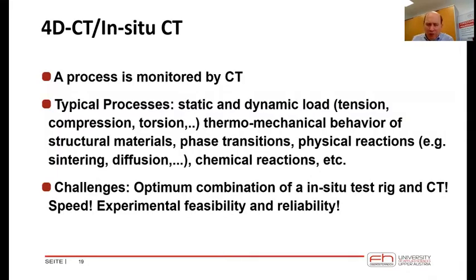Now we'll come to 4D CT or in situ CT. In this case, a process is monitored. So the typical processes are static or dynamic load, tension, compression or torsion, sometimes also the thermal mechanical behavior of materials, phase transitions, physical reactions like sintering or diffusions, or also chemical reactions. These reactions, these processes can be monitored by CT.